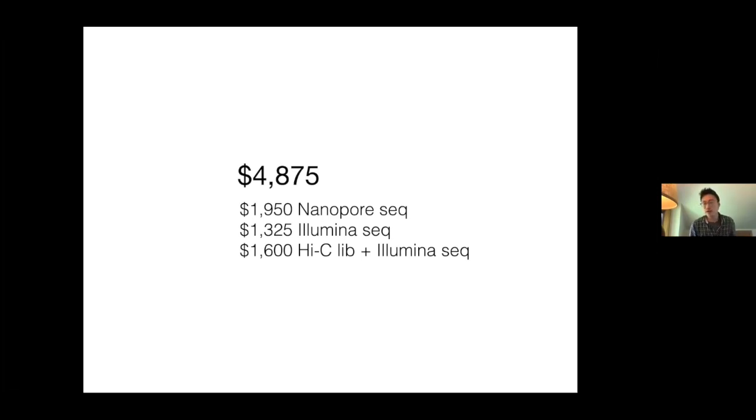I think that contig N50 you want to shoot for at least one megabase, and then you generate Hi-C data. To generate Hi-C data, you can buy a kit from Phase Genomics or Dovetail Genomics. If you do it yourself, it takes I think 2 days or so to make the libraries, and you send a library for sequencing. Regular Illumina sequencing would do, and then you map the Hi-C reads back to your assembly, and there are several different pipelines and algorithms that can help you scaffold your genomes with the Hi-C data.